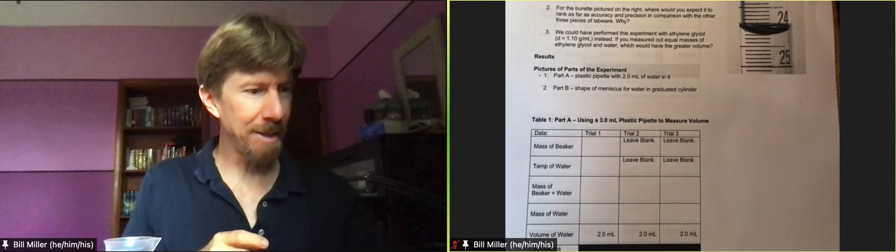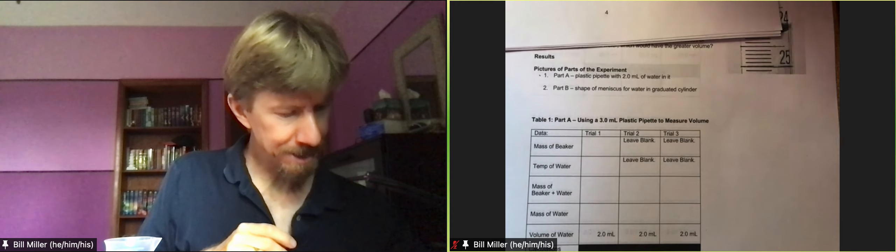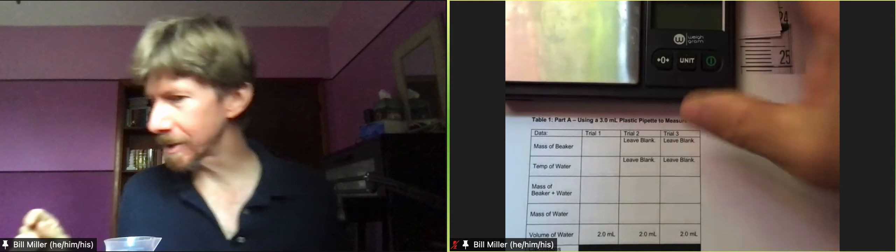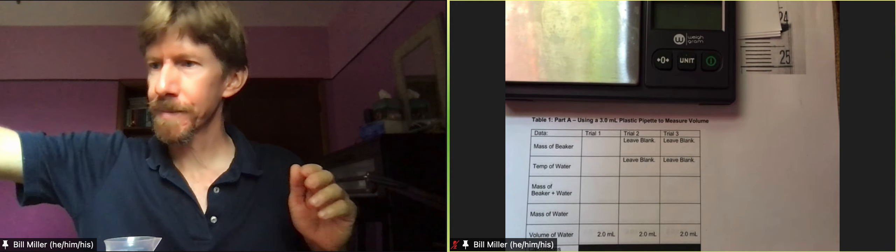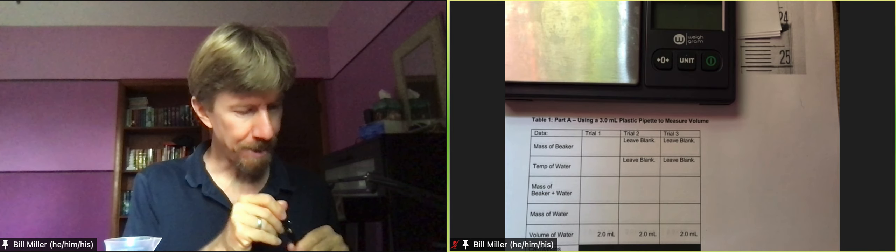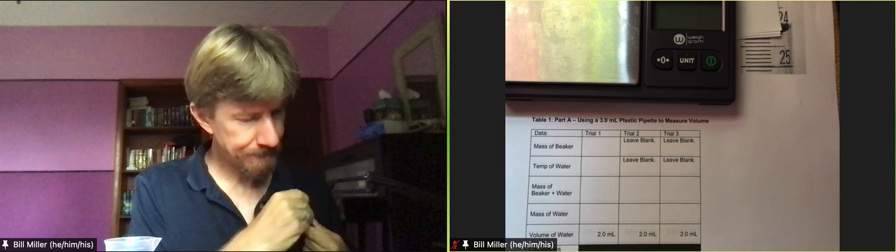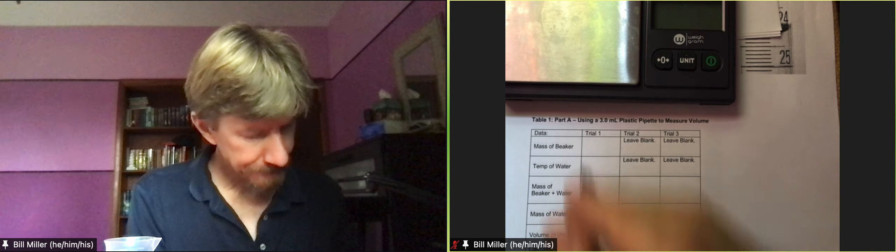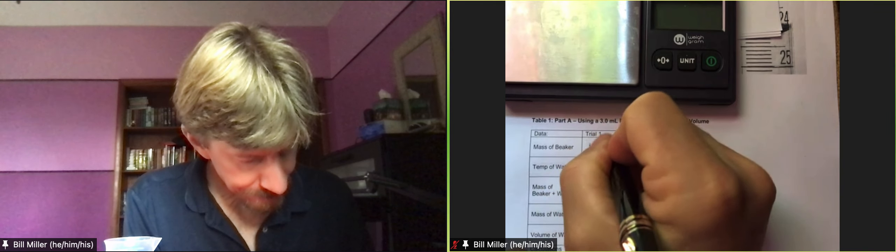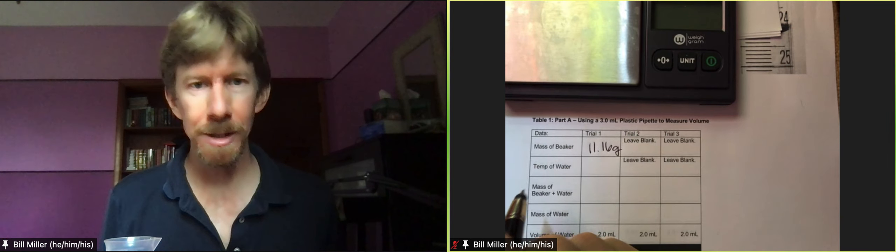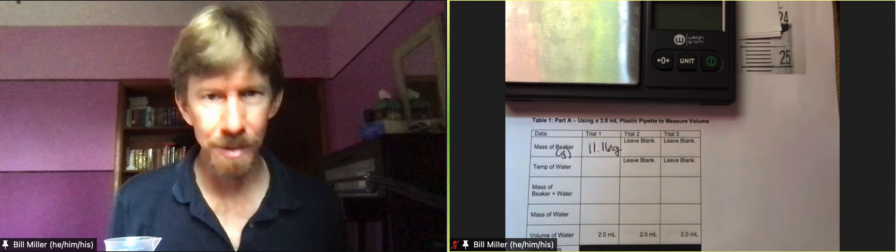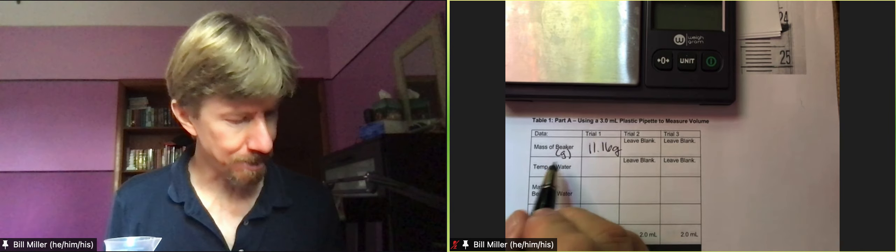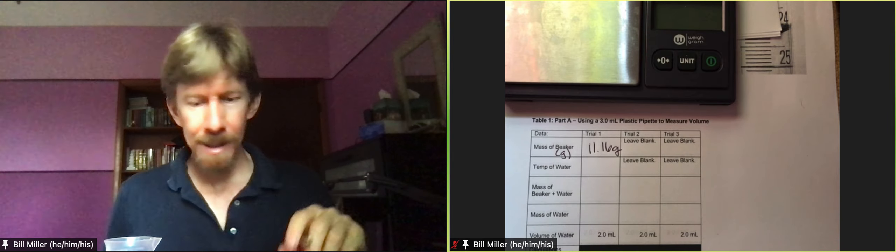Let's see if you can see my, there we go, 11.16 grams. I have my tables here and 11.16 grams is going to go here. I'll put the g there. When you put it into the google sheet you won't put g.